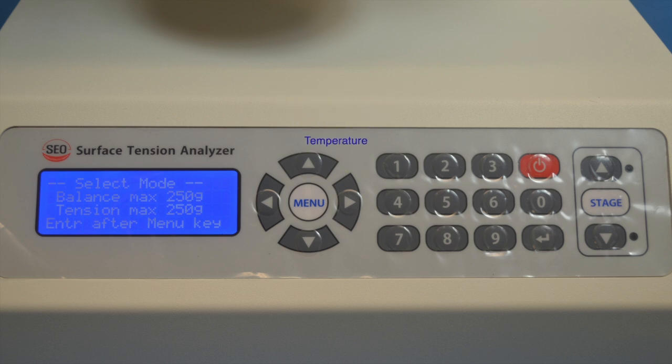The keyboard and display are quite normal and easy to understand. On the right-hand side is the controls for moving the stage up and down when you need to do it manually. You have a number pad.